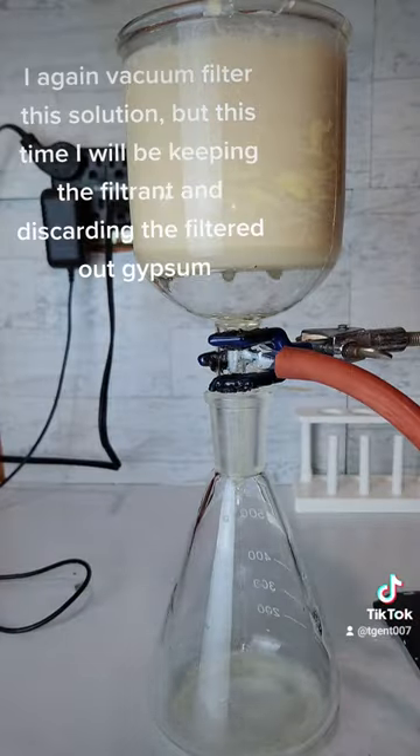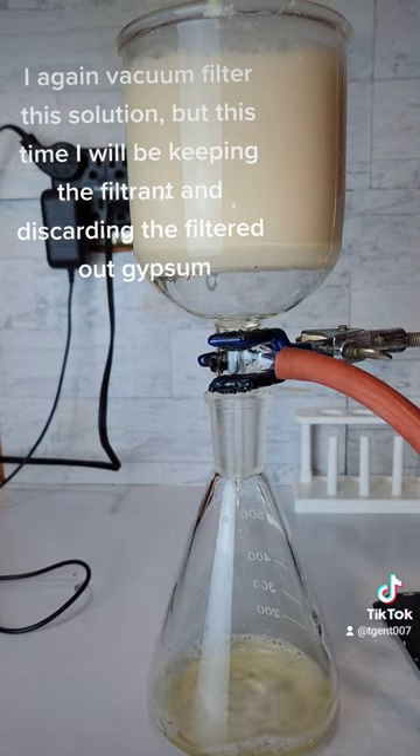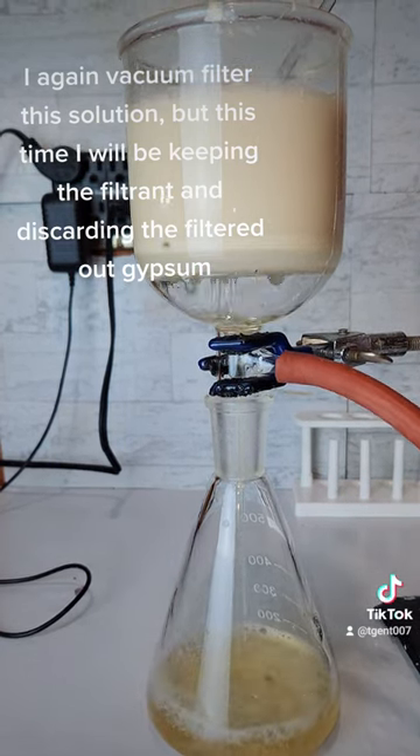Calcium sulfate is also called gypsum and can be useful. I again vacuum filter this solution, but this time I will be keeping the filtrant and discarding the filtered out gypsum.